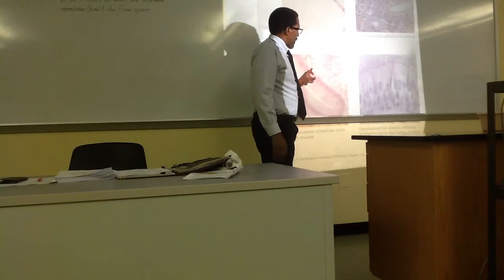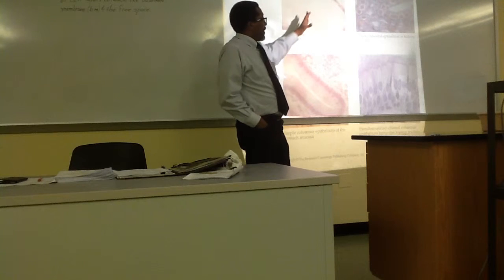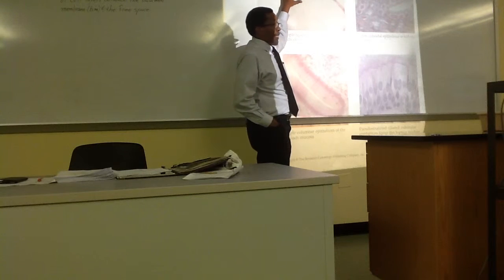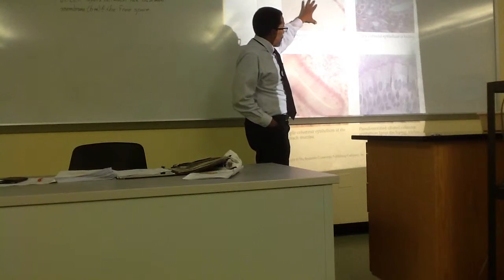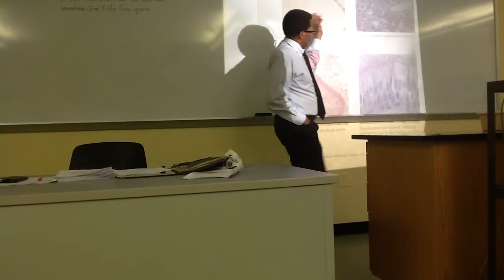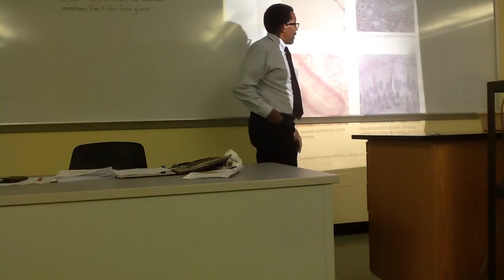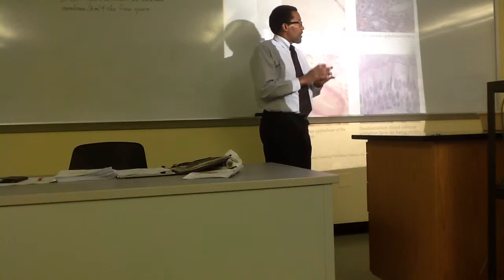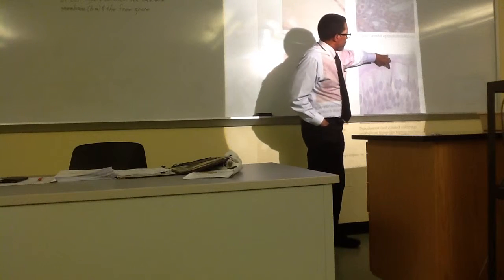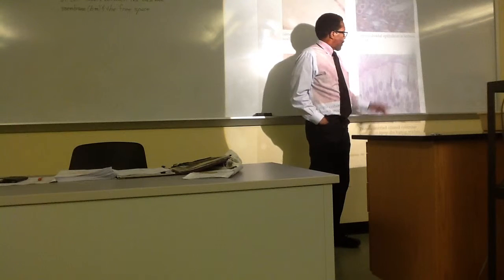So when you're looking for epithelial tissues, one of the general characteristics of epithelial tissues is that it's next to a free space. The free space won't stain. So you can identify the free space because it's going to be colorless, like this, for example, or this, or this. All right. Another characteristic of epithelial tissues is that the cells will be very, very close together. You would see very little space between cells, very little extracellular space between cells.